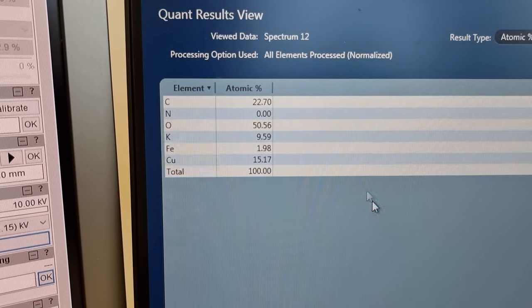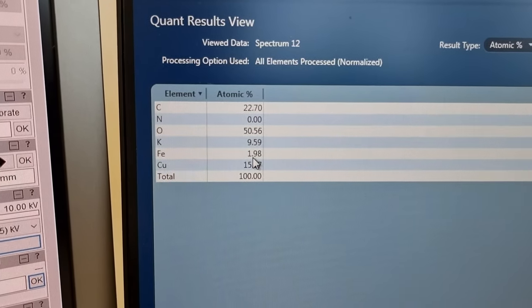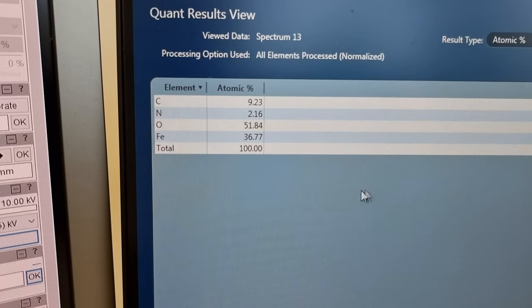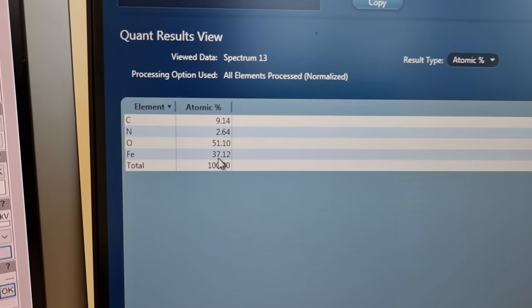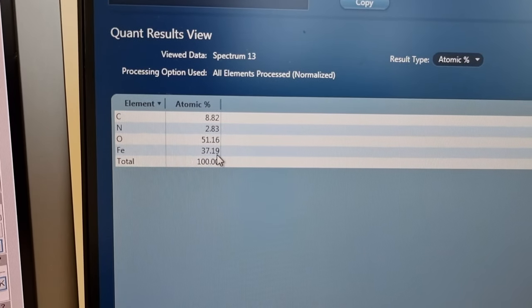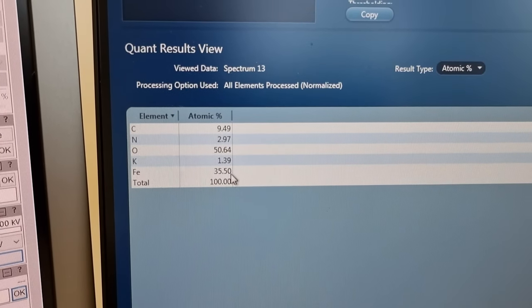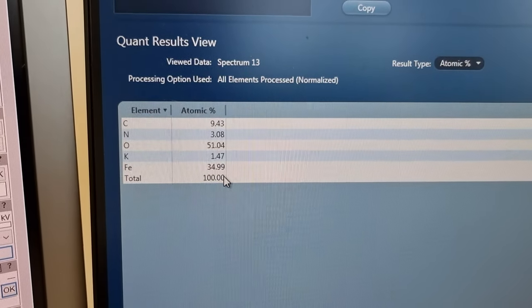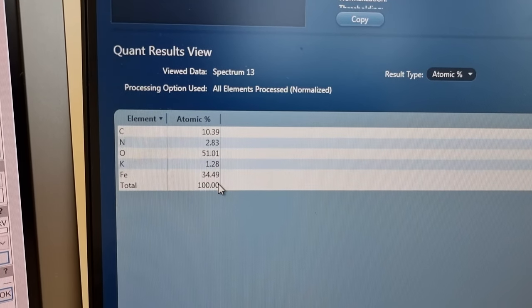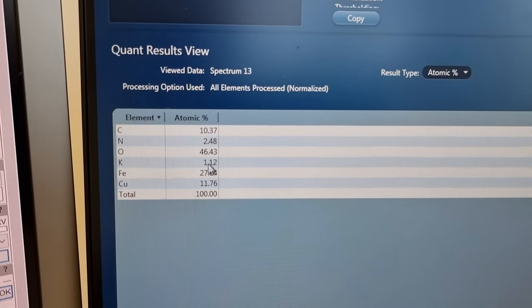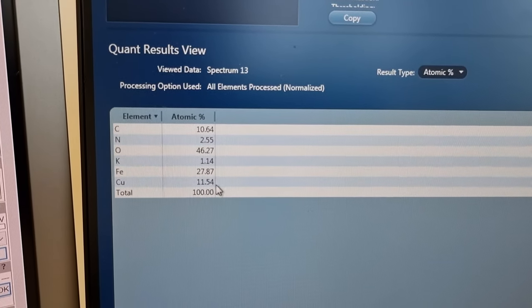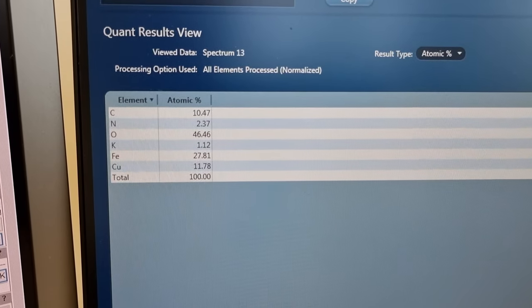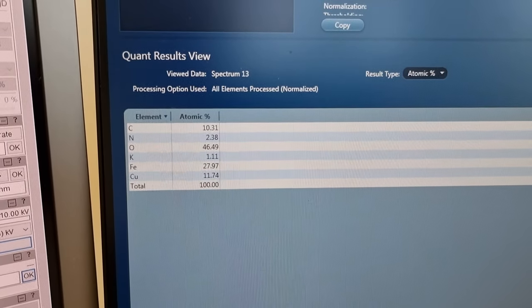We have potassium and iron, and this one here has also got iron. In fact, it's 37% iron, this torus, which is interesting. There's very little copper, 11% there. That is in the ring of that.